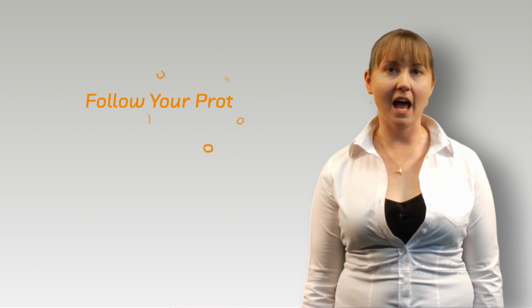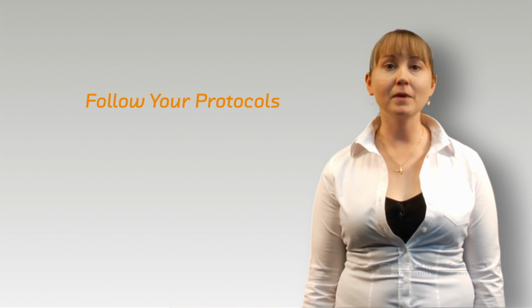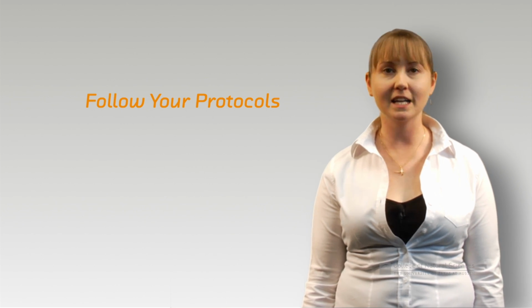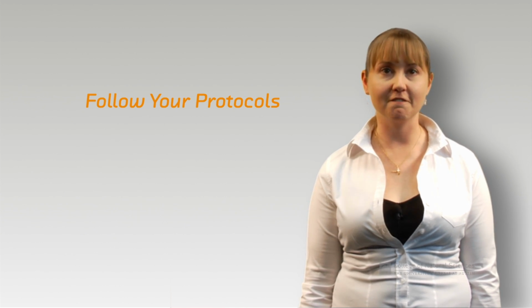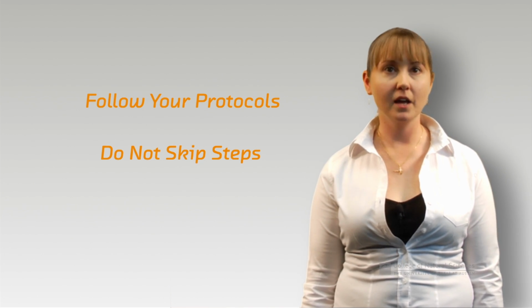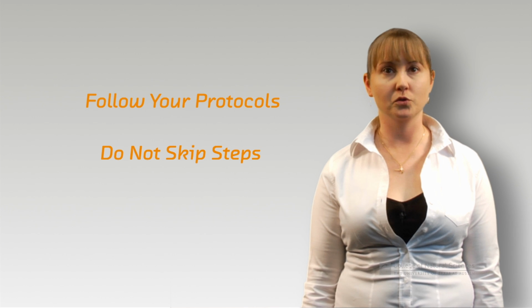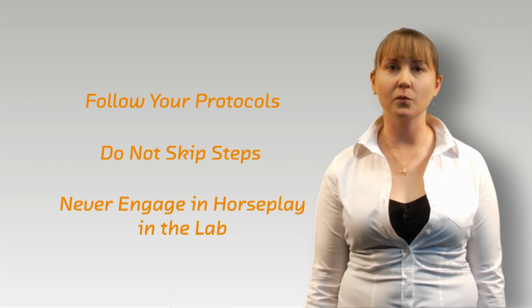It is critical that you don't take unnecessary risks when working in the lab. If you are prepared for lab and are not rushing, you will minimize unnecessary risks. Be sure to follow your protocols exactly and do not cut corners. Not only will this help to ensure your safety, it may also save you from ruining an experiment by cutting out something that you shouldn't have. Be patient and be sure to wait for your reactions to finish. Do not skip steps. Even though it seems like this could save time, it could create a dangerous situation and ruin your reaction. Never engage in horseplay in the lab and be careful not to startle anyone while they are working.